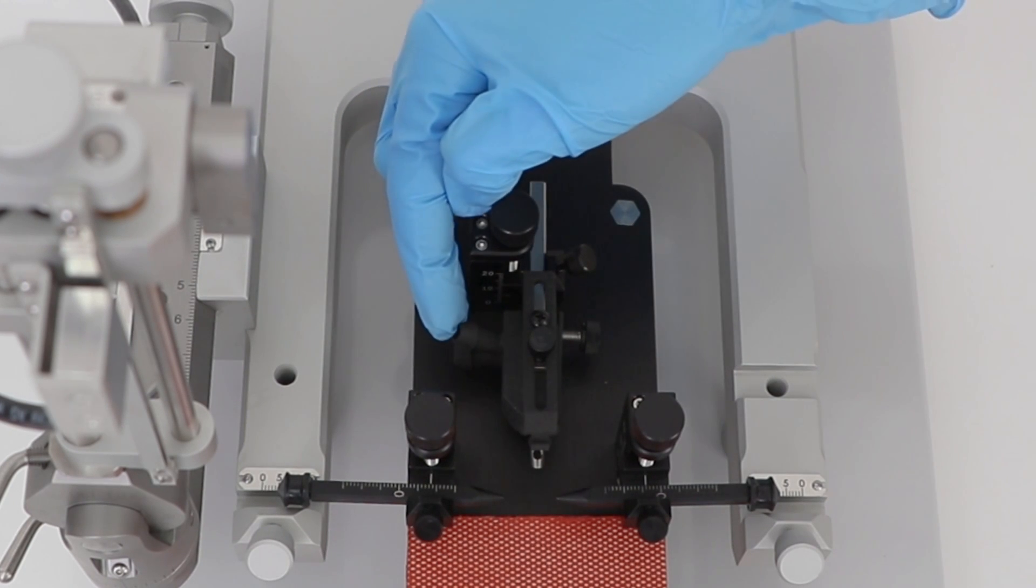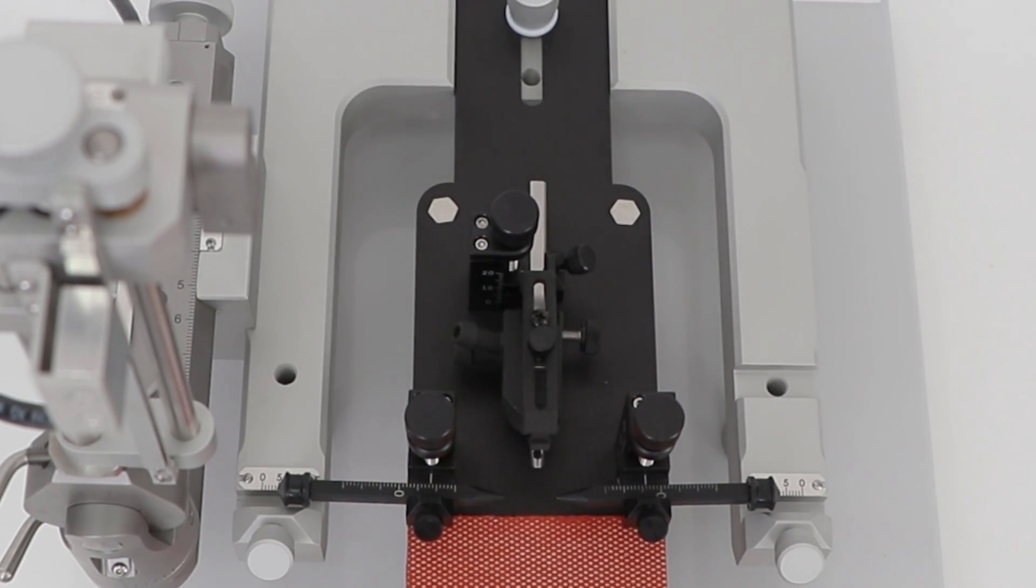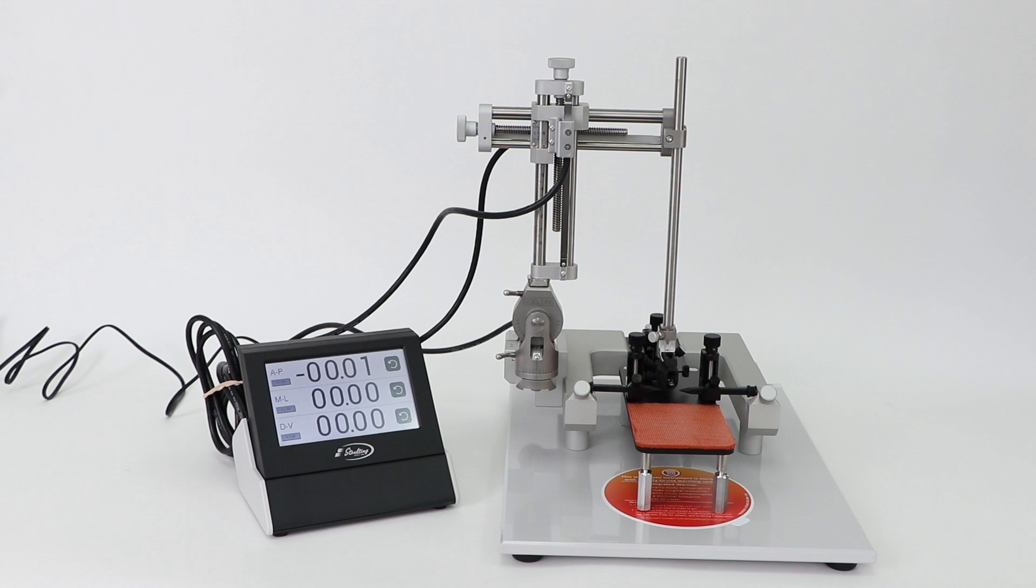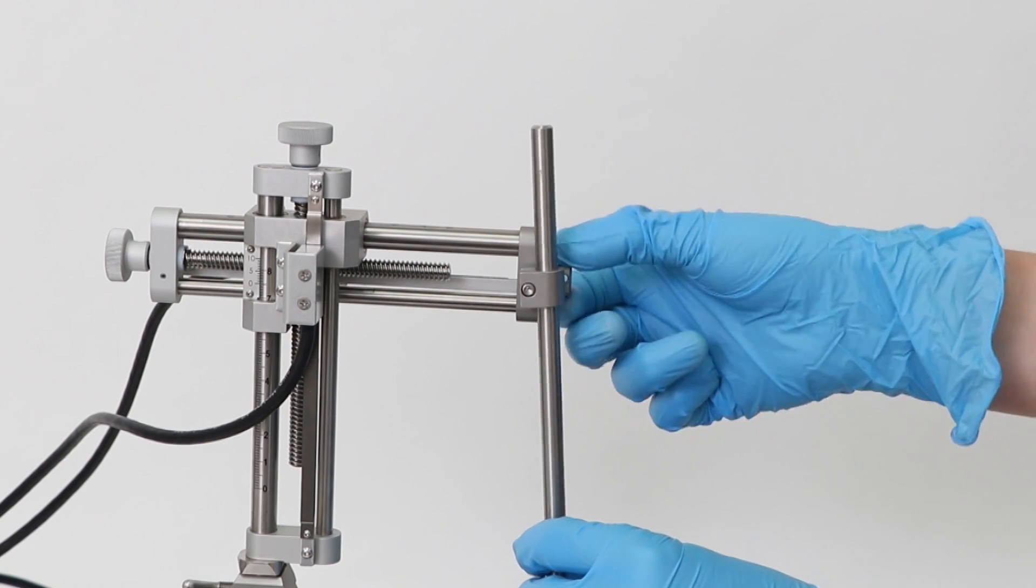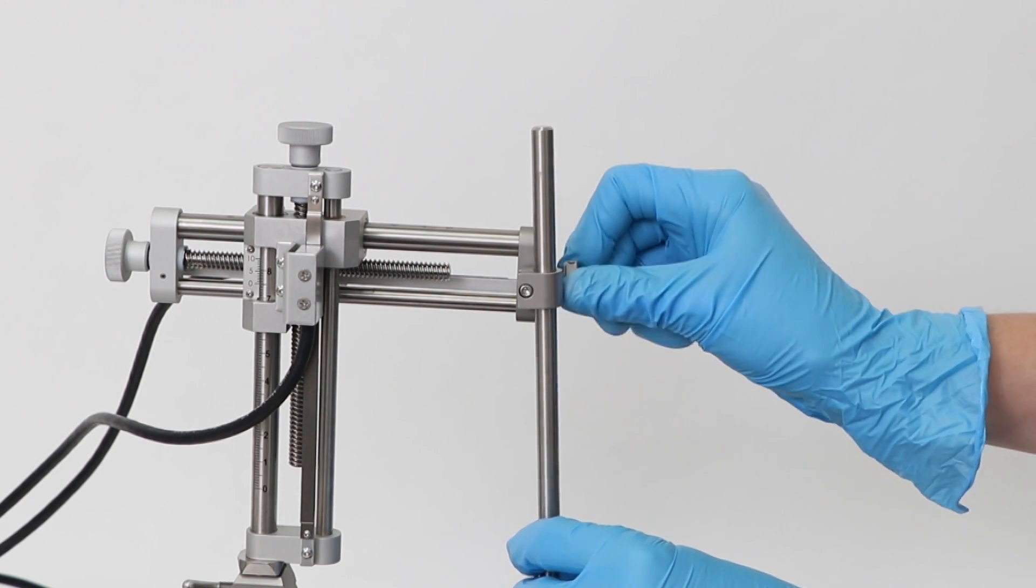Connect your anesthesia line to the back of the mask block. The manipulators should come with the probe holder already attached. If you need to remove it, loosen the screws here and set it aside.